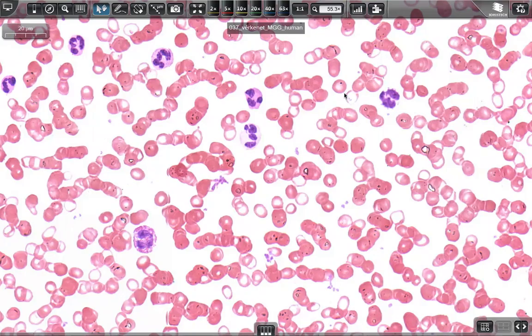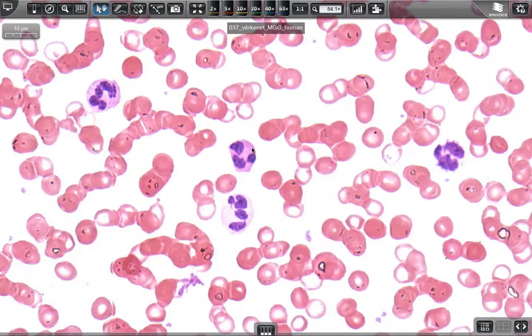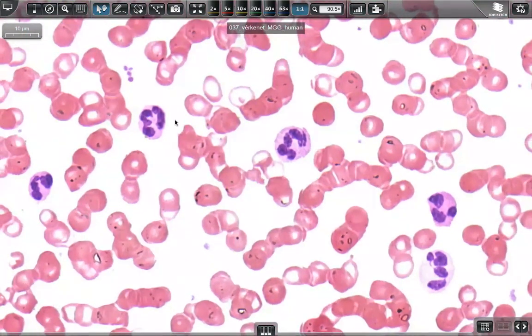That's neutrophil. It seems monocyte because of the bean shape. It's really pinkish, but I think it's just a darkly stained neutrophil because it's not bilobed. It's segmented, so it's a neutrophil.